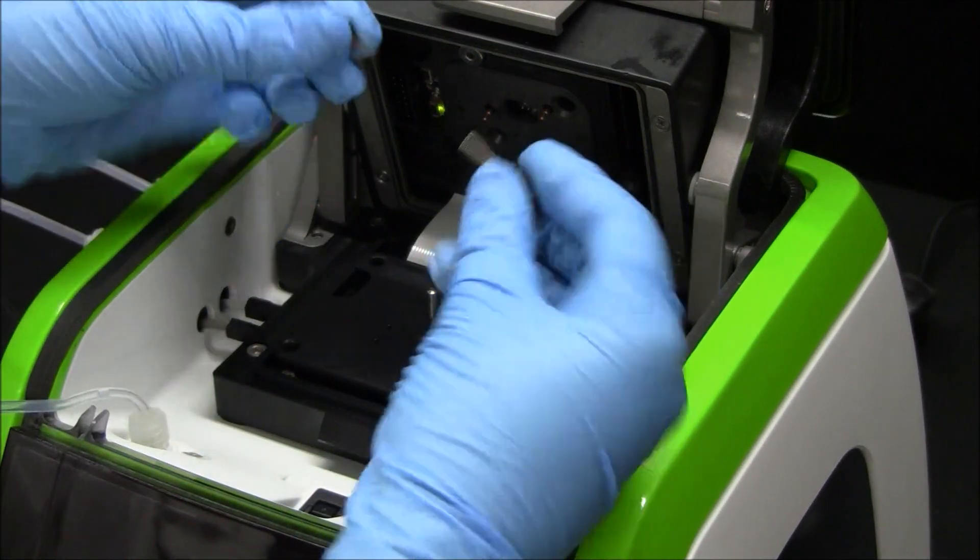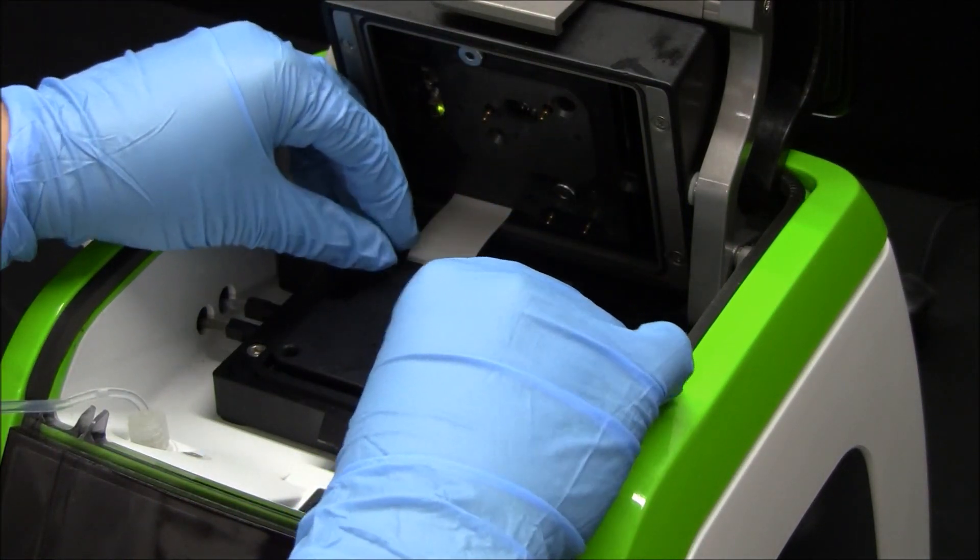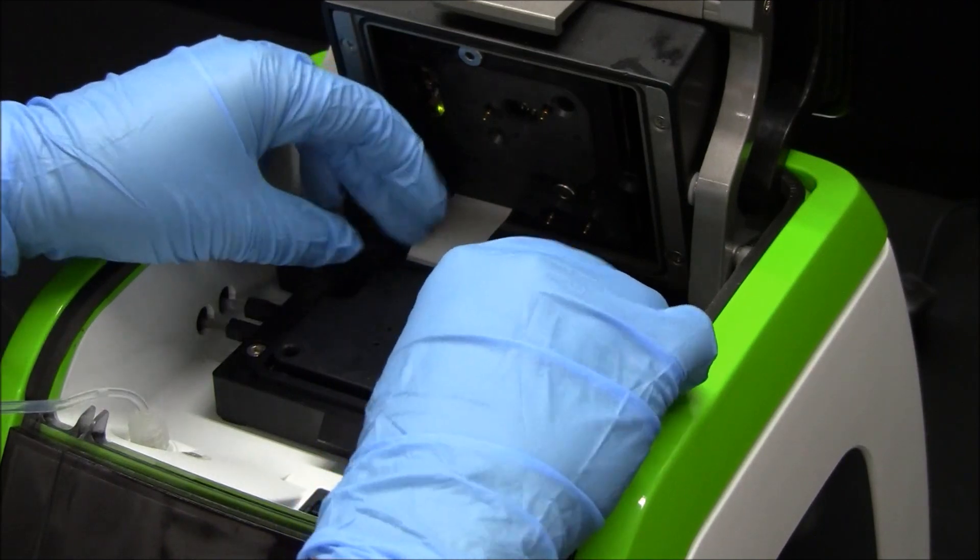Use the four thumb screws to secure the electrode block to the analyzer. Finger tighten until secure.